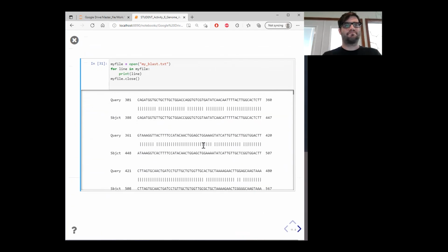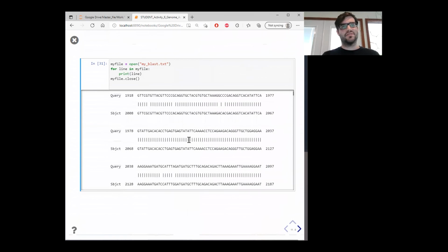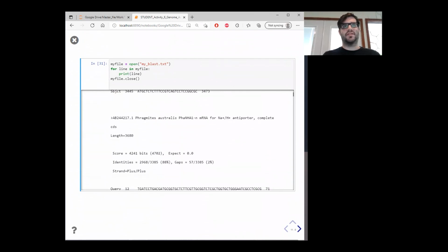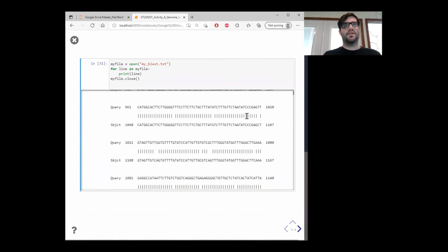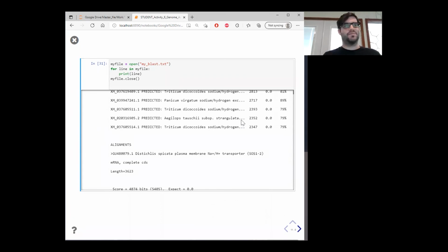And it's pretty high quality. So we can scroll through here. By default, it will output 500 individual sequences, which is probably what it output here. So you can see this is a massive file. We might only care about the first couple entries, and you can specify that as well. So we could use this to identify the species that we're working with.